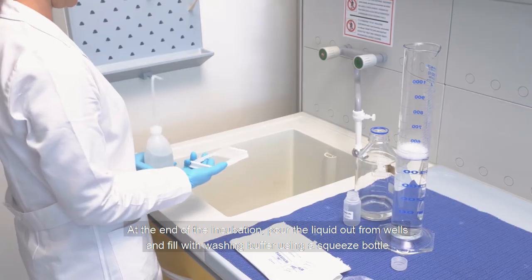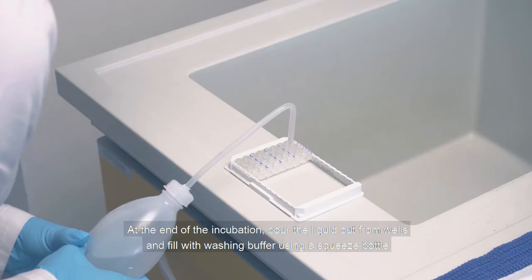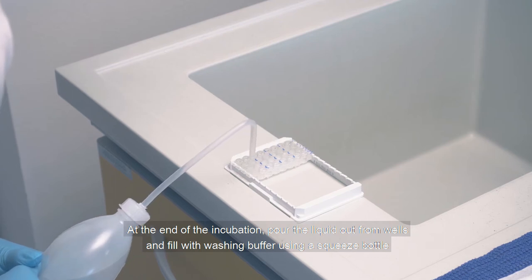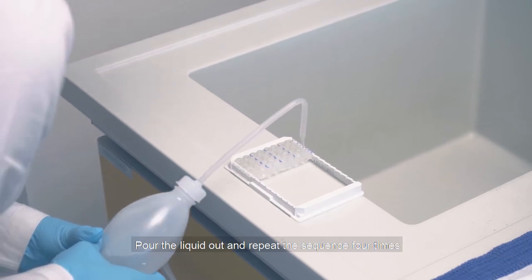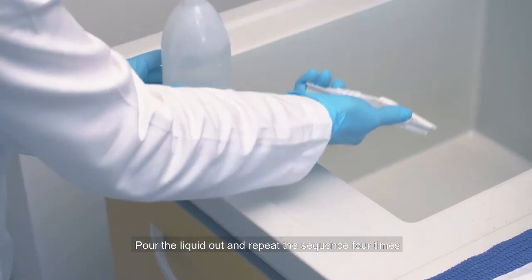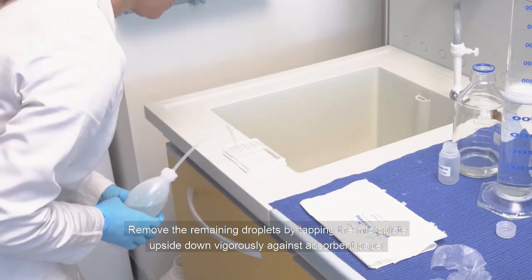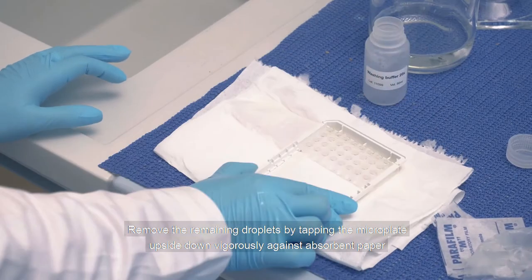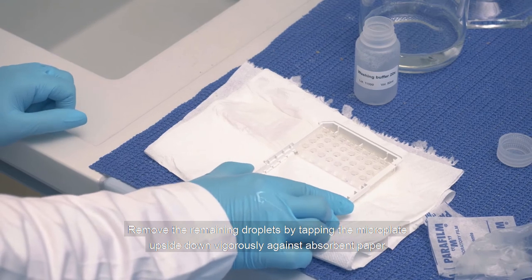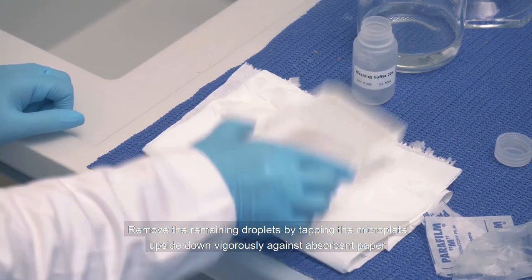At the end of the incubation, pour the liquid out from the wells and fill with washing buffer using a squeeze bottle. Pour the liquid out and repeat the sequence 4 times. Remove the remaining droplets by tapping the microplate upside down vigorously against absorbent paper.